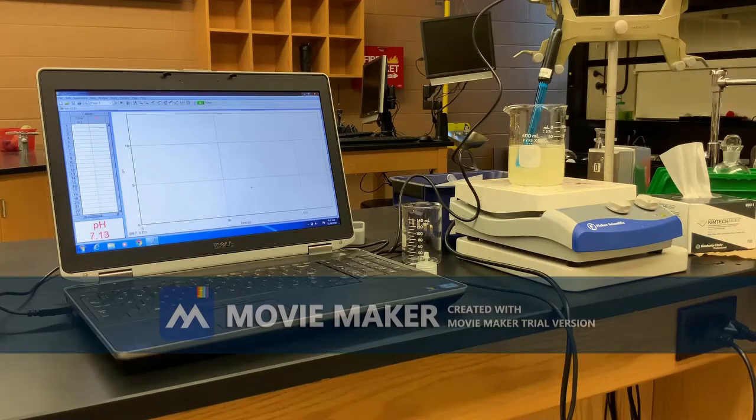Now we've got to decide on a final pH. And it's jumping around a little bit. It keeps going back to 7.13, 7.08, 6.88. So we've got to pick one.